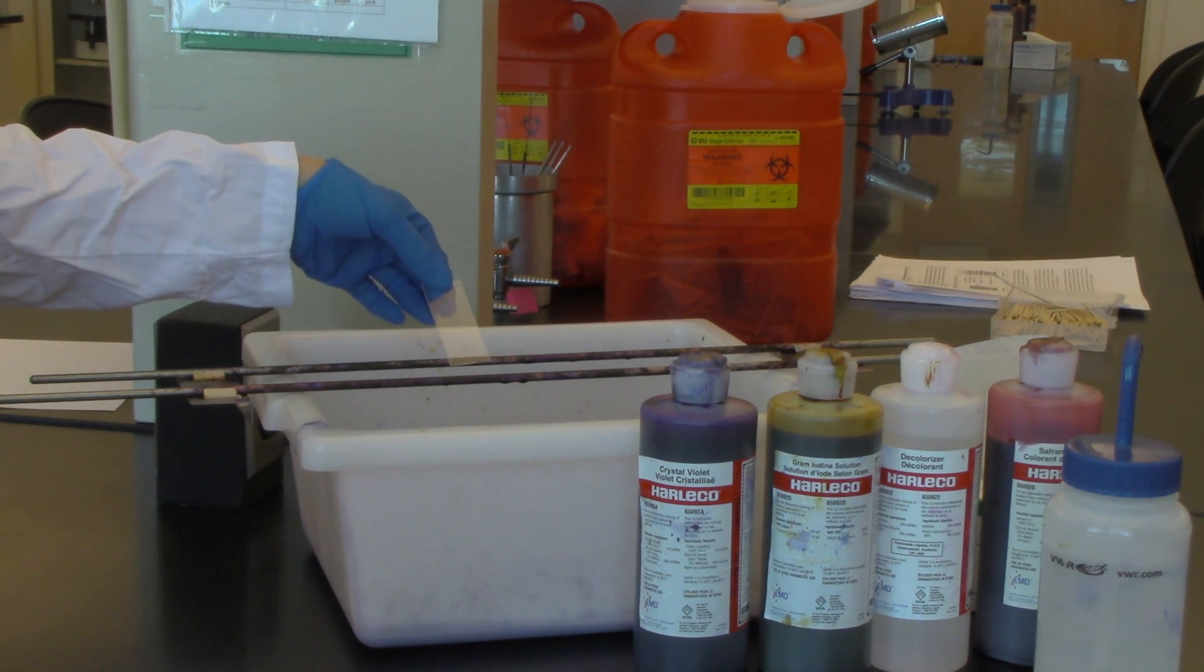This is the differential stain, the gram stain process. Differential stains are unique from simple stains in that they use at least two dyes, two different stains, and you're trying to distinguish between different cell structures.